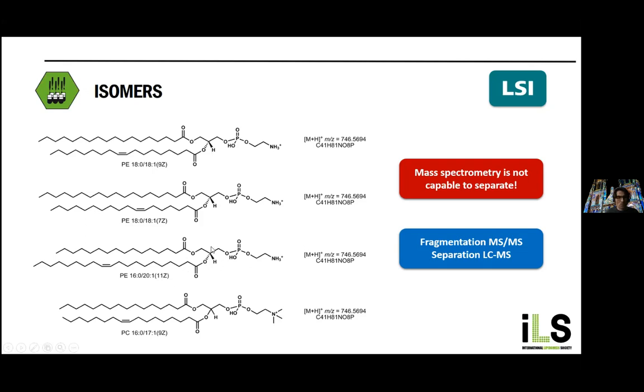So it's easy to differentiate these 2 isomeric species by tandem mass spectrometry. You have also seen that separation is possible. So isomeric species, not simply the mass can differentiate, but we can use, for instance, fragmentation to differentiate these molecules, or also differentiate the acyl chains in negative ion mode. It's harder to differentiate double bond positions, but you will hear more advanced techniques in the coming days.